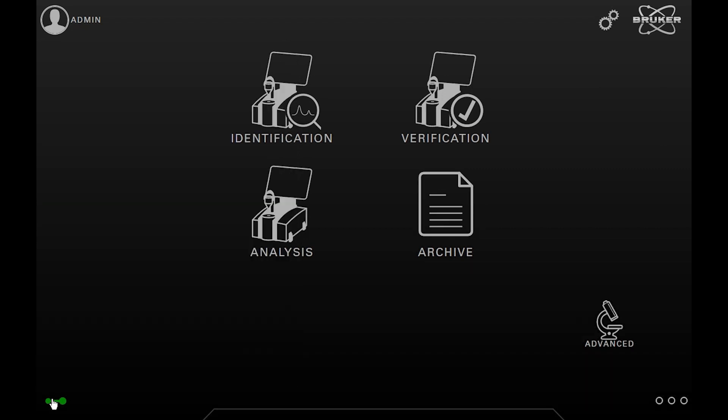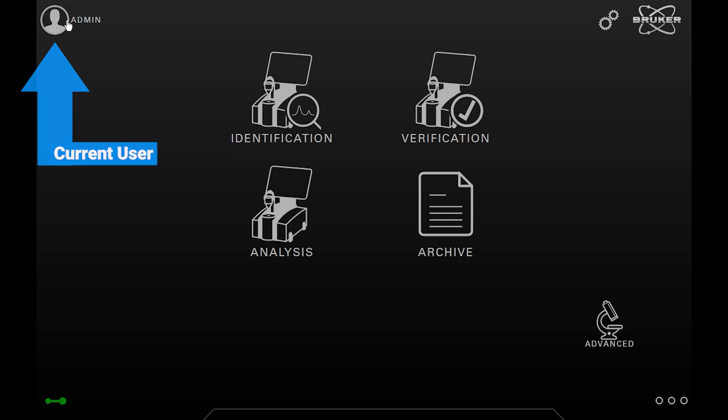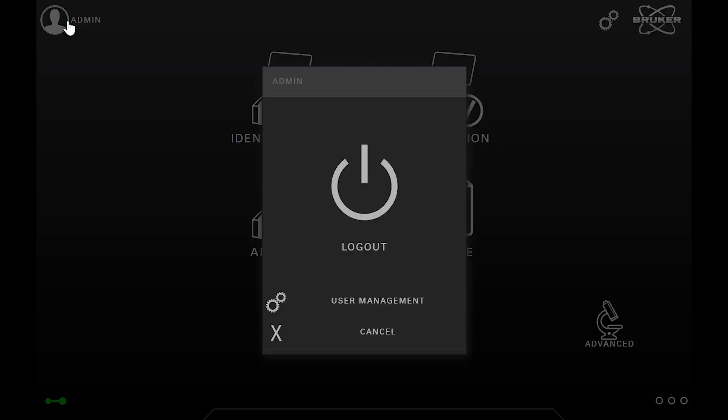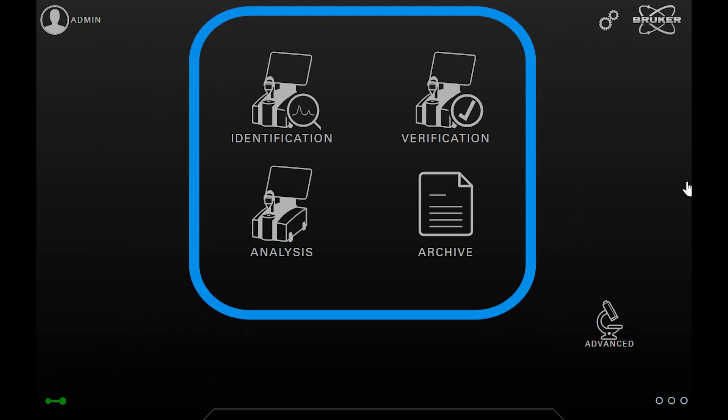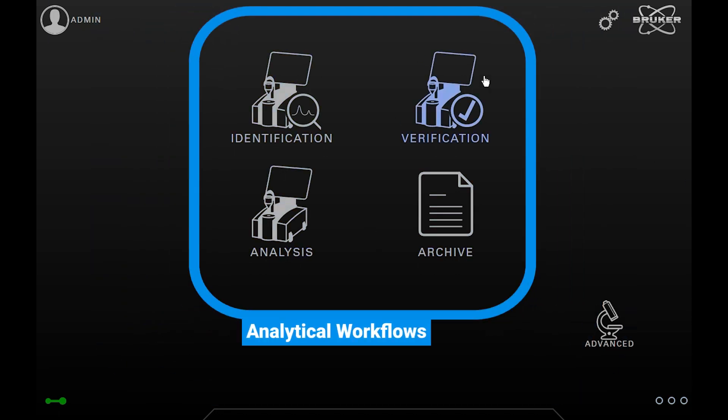If you tap on it, you can log out or directly go to the user management. Finally, we have the large icons of the workflows that will be presented in extra videos.